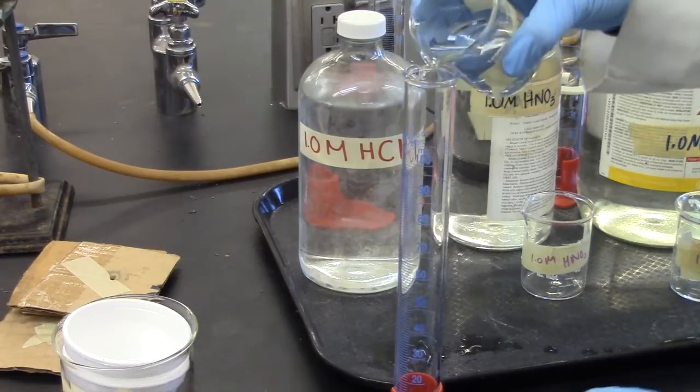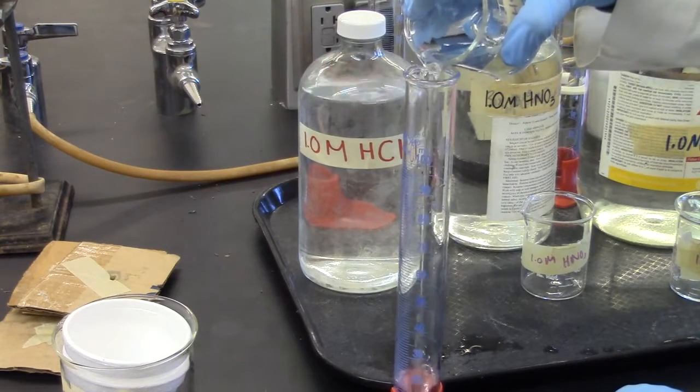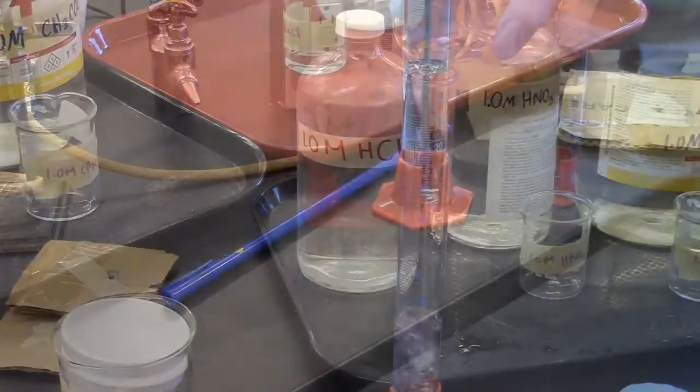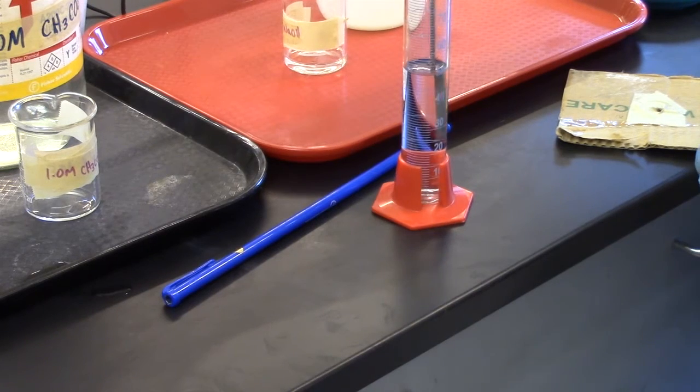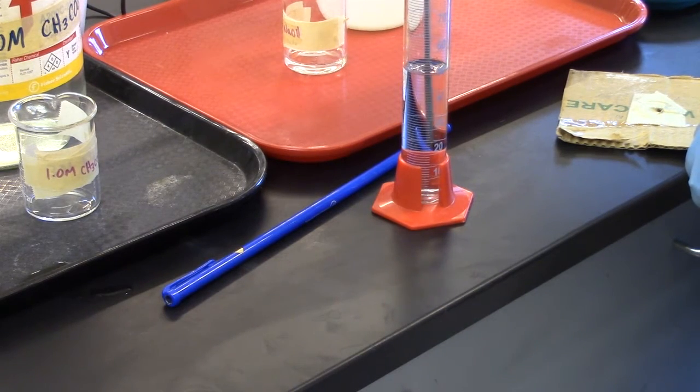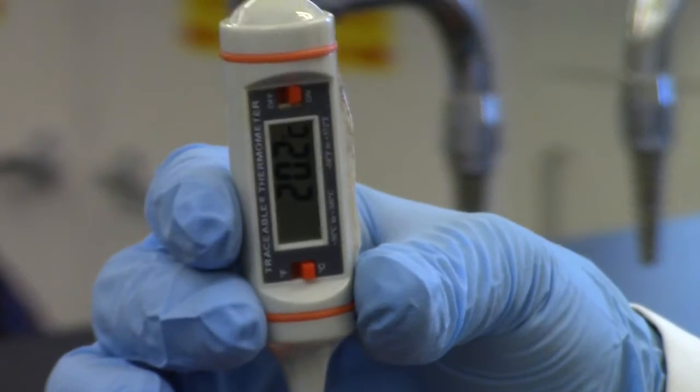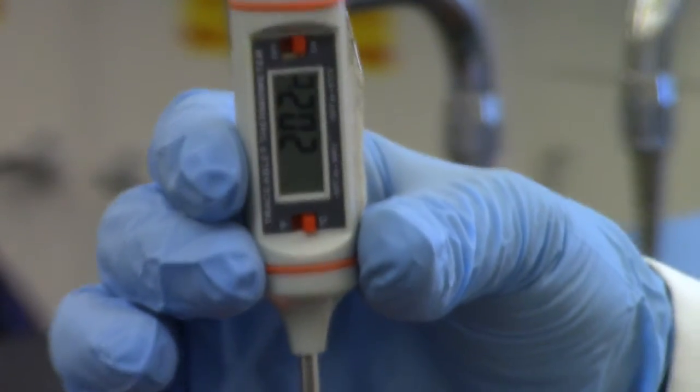Next, measure out 50 milliliters of hydrochloric acid. Take the temperature of the sodium hydroxide solution, and that will be your initial temperature.